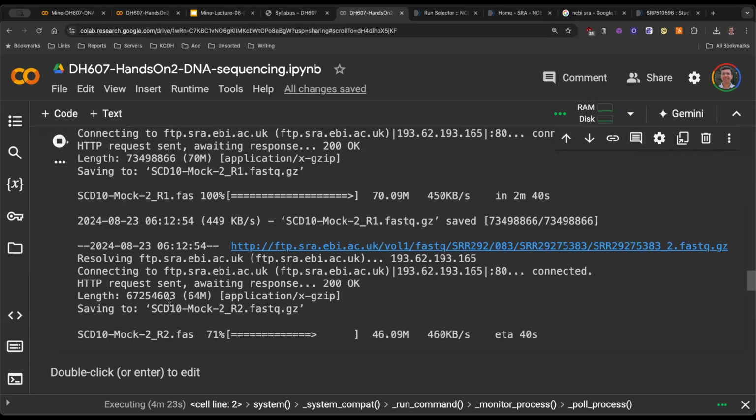But this doesn't make sense. It will likely not happen that you get a shorter read. Every time you see a FASTQ file, all the read lengths should be the same. How do you make up for the remaining 80? Actually, this is slightly blown up. Let me be a bit more reasonable. So you get 130 as your fragment length. What do you think happens to the remaining 20 nucleotides?